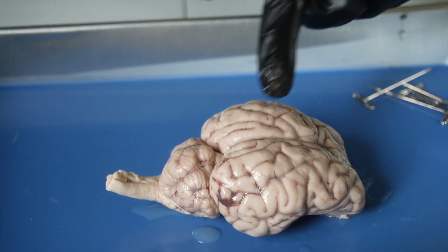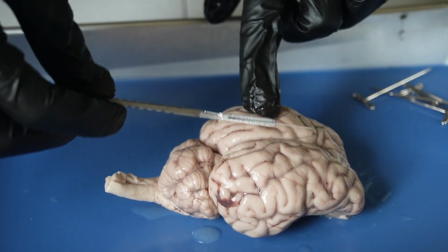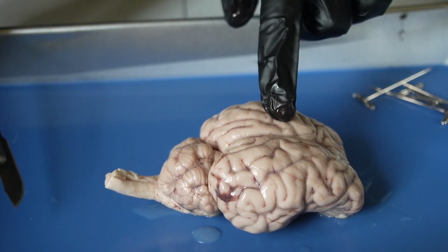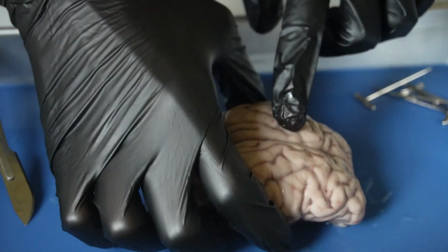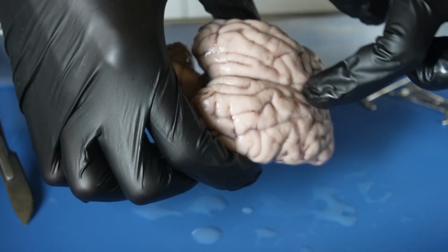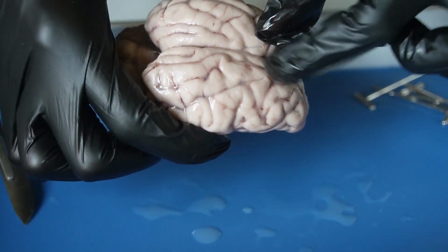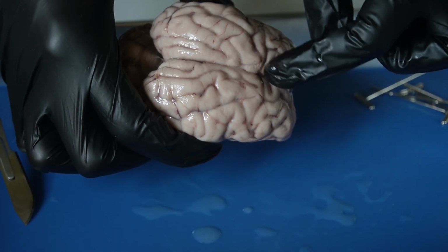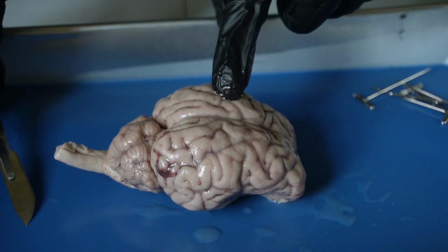Oh, my goodness, I keep forgetting. I think I mentioned this already, but the corpus callosum, which is this line here, these are the nerve fibers that connect the right and left hemispheres of the brain, and they also facilitate communication between the two hemispheres.